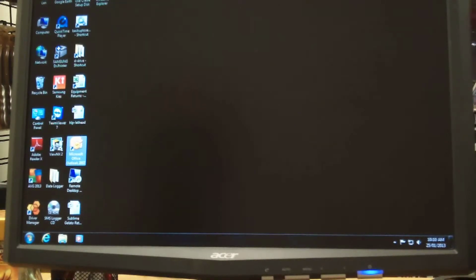And you do need to install the software because they use a Windows computer to get the data and draw pretty graphs and make the data look like it's perfect, so that whatever's happening in your fridge you can find out and you can see it, and you can store it for your records. You can have it stored on a computer, or you can print graphs so you can show anybody who's interested, whether it be the TGA or if you're a restaurant or a food storage facility, you can save that data for your food safety inspector or your HACCP system, so anything like that.